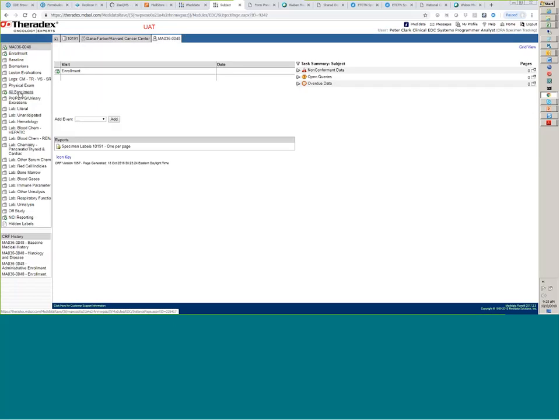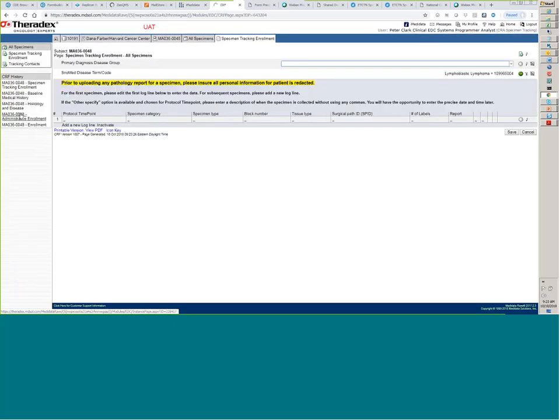So we'll focus in on this all specimens folder. And here we see that the SNOMED disease term and code got derived in from that histology and disease form. There's another smaller list of diseases. It's about, I think, under 100, but it is a list that the biorepository nationwide, Children's Hospital, they like to use this. So we're including this field as well, and it should, of course, match up with the SNOMED disease in some way.